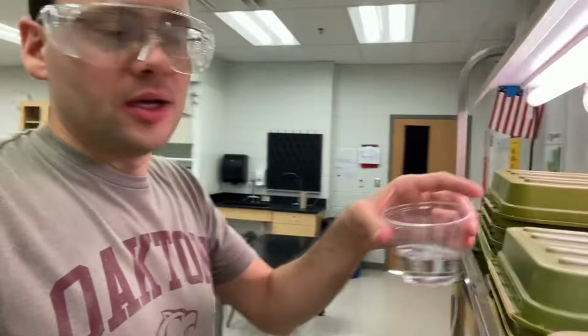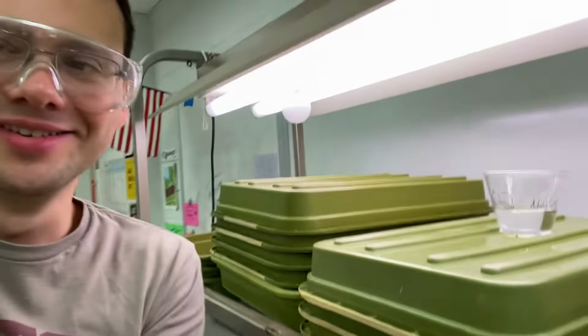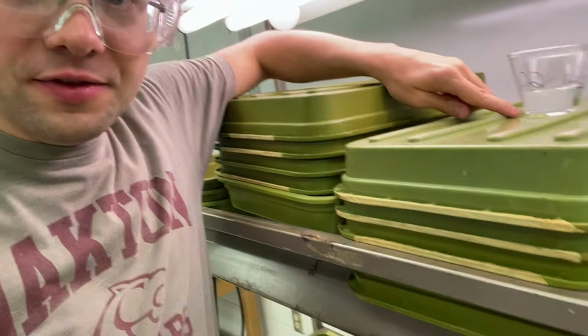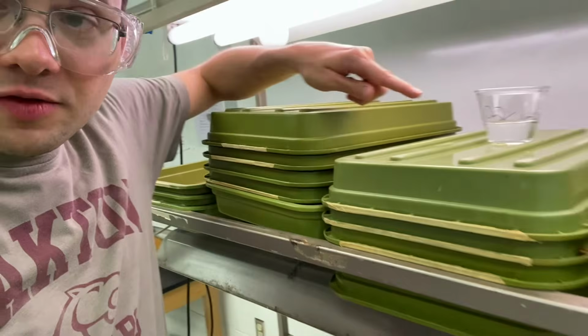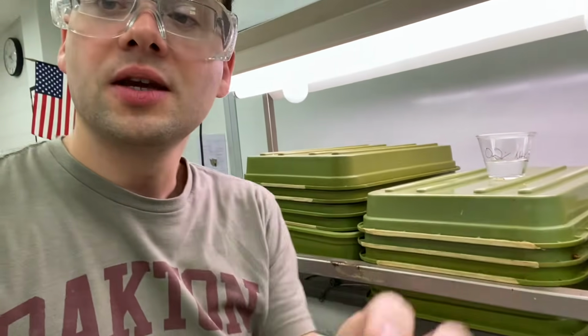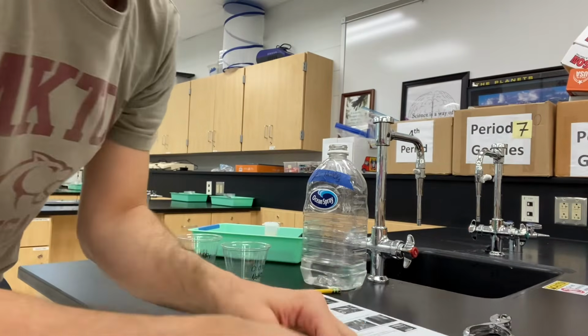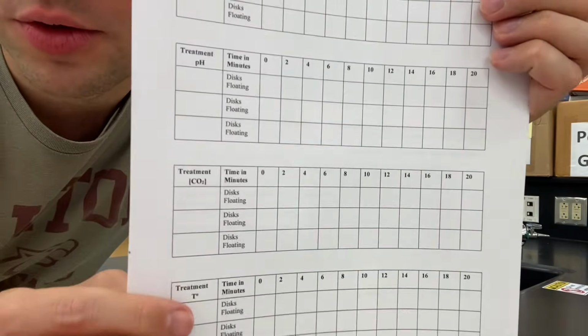I'll have these trays set up around the room on these little plant growing stands. And you are going to count the number of floating discs that rise to the surface every couple of minutes. And you've got space in your lab to record that data. And what you're gonna see now, if you go to the data collection page, the data table page, is that there are 4 different groups.